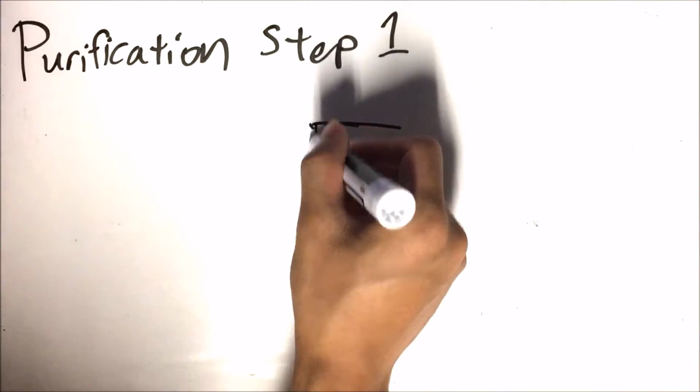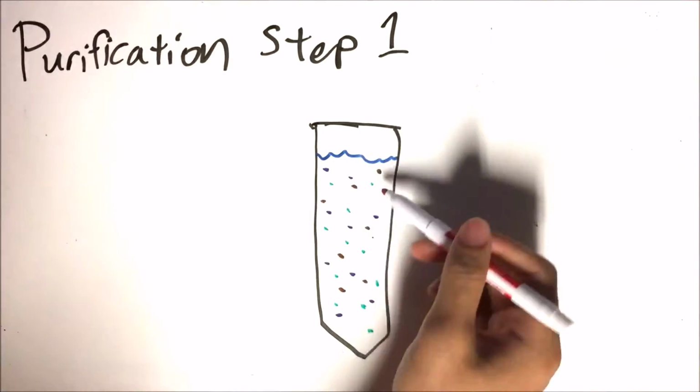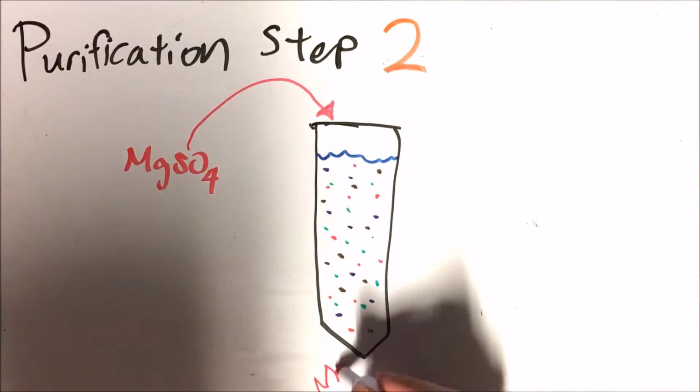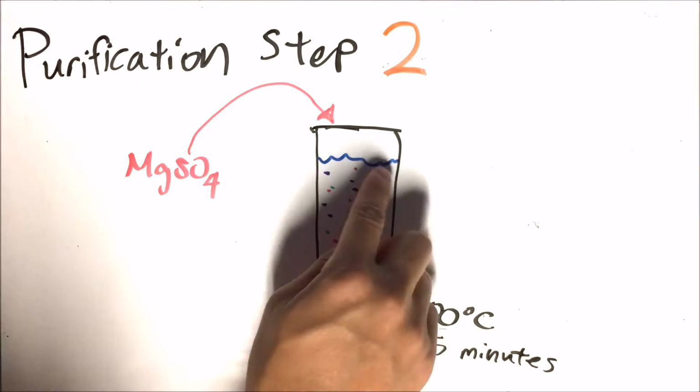After this step, we have exposed AP to the mixture and removed the E. coli cells, but this is only a fraction of the process. For our second purification step, we take advantage of a protein's tendency to denature and unfold when heated up to high temperatures by breaking the intermolecular forces that hold it together.